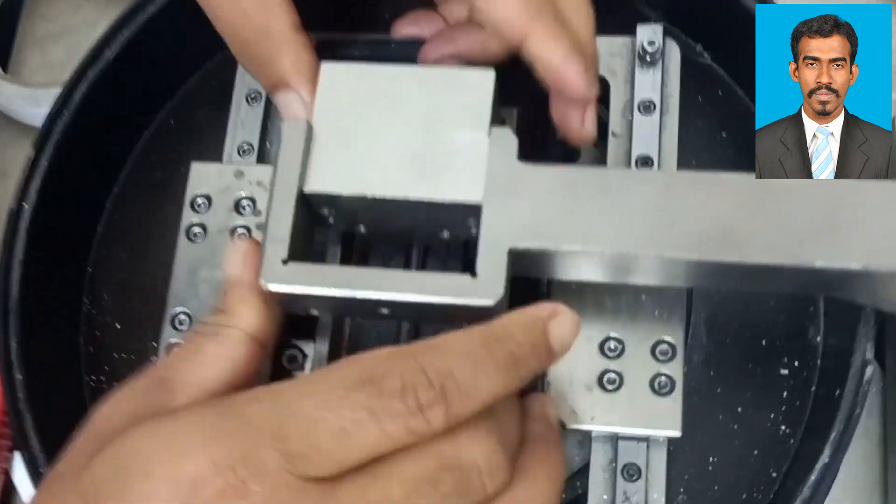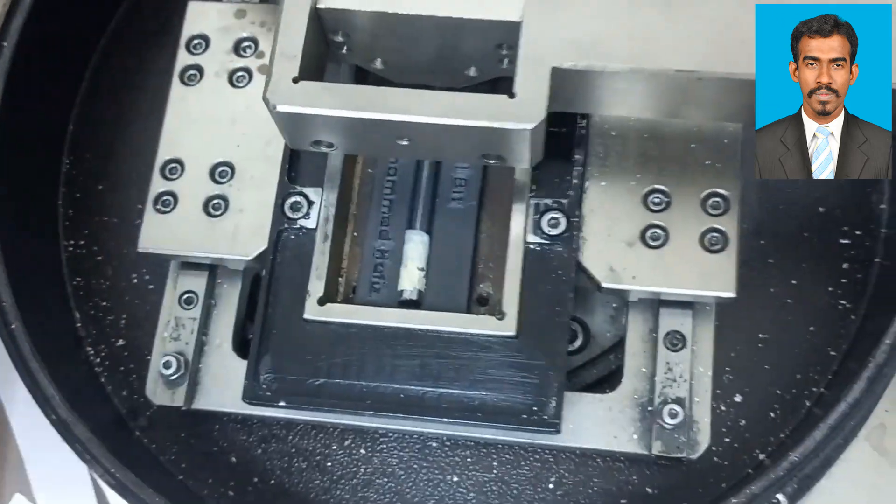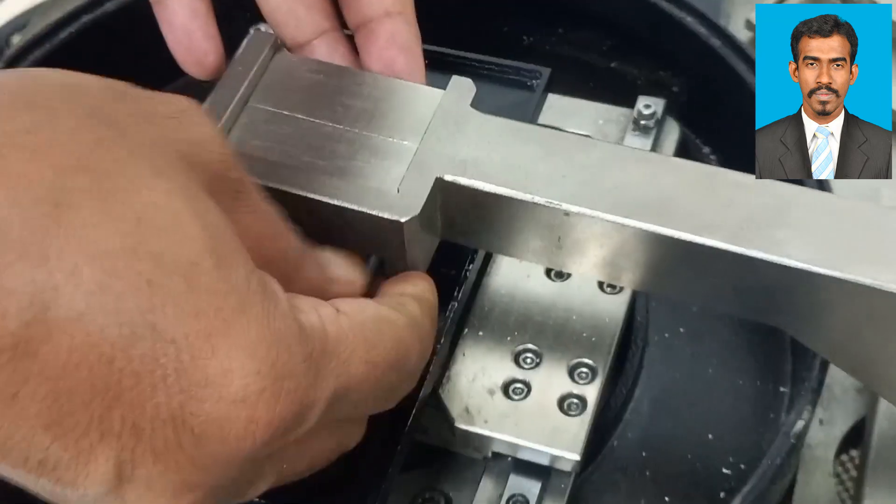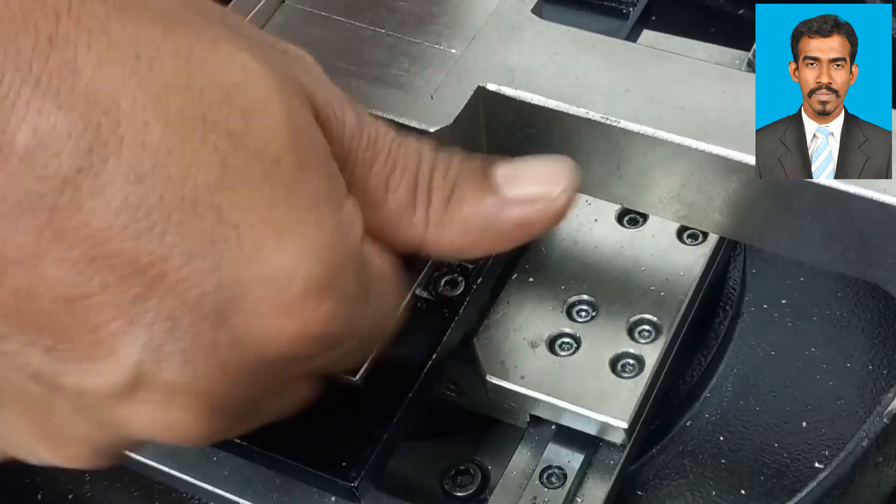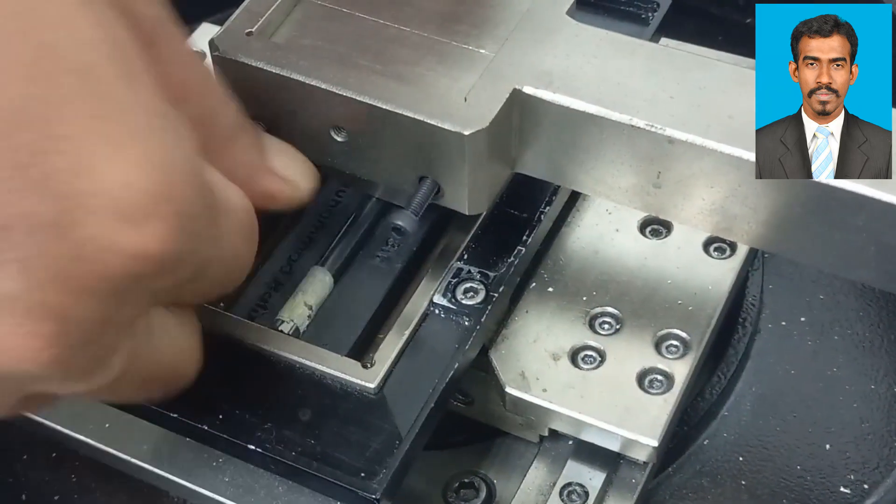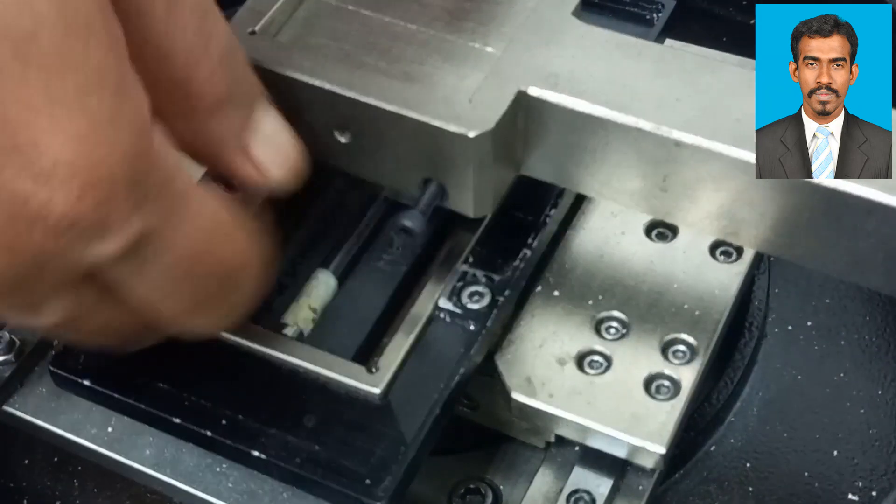When fixing the ball above the specimen, we need to ensure that the ball and the specimen are in contact. If we are going to test the coefficient of friction, they need to be in contact with each other.